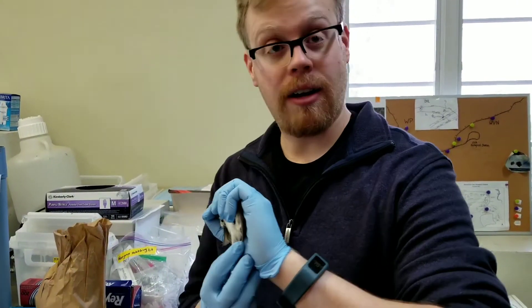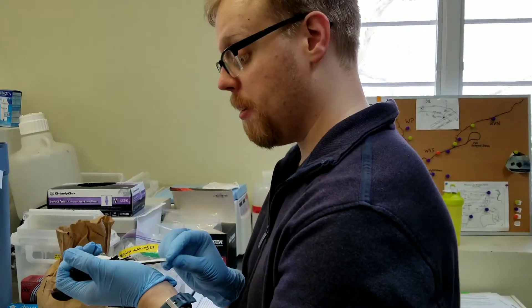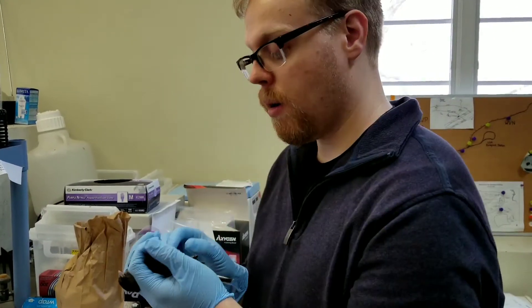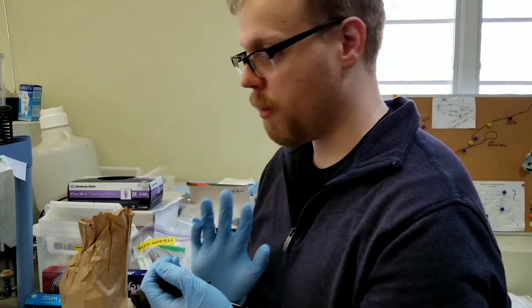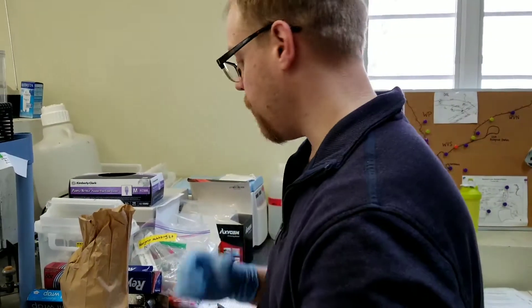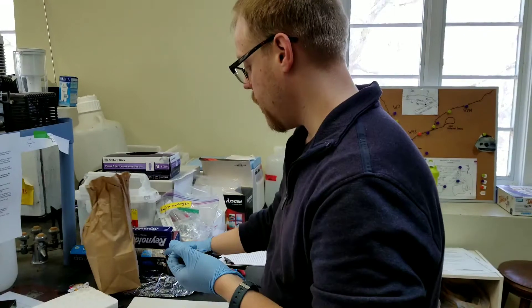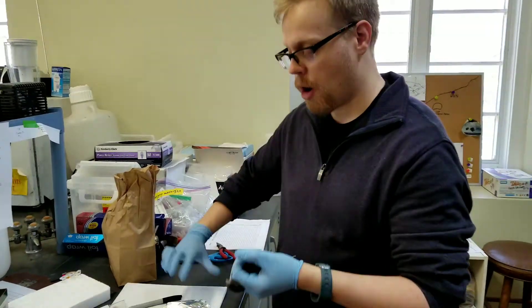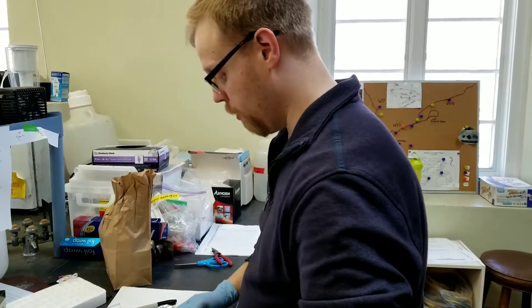With me is a dark-eyed junco, specifically the subspecies carolinensis. What I'm going to show you today is how to take a preen oil sample from these birds. These birds have been studied in chemical ecology and we're trying to understand how preen oil can act as a chemical cue for these animals.